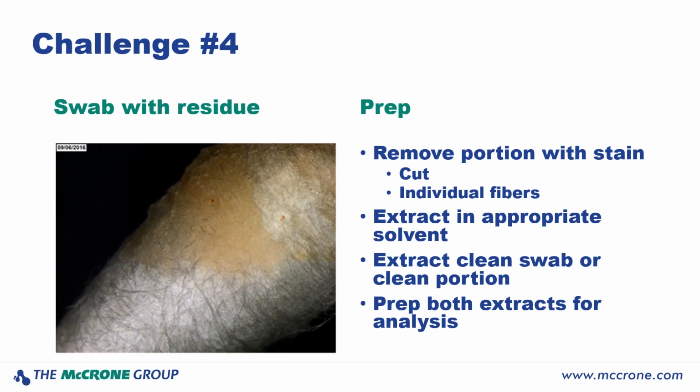For example, if you have a manufacturing vat that had sodium chloride solution, and then you found a residue on the edges that you wanted analyzed, well, we'd need a clean swab. We'd need a swab that had been dipped in sodium chloride solution, and then we would need the swab that had picked up the residue. And all of those are going to be treated in multiple ways. And each of those extracts is going to be submitted for analysis so that we can properly account for all of that information, if it's genuinely from just the residue or if it came from either of those matrices.